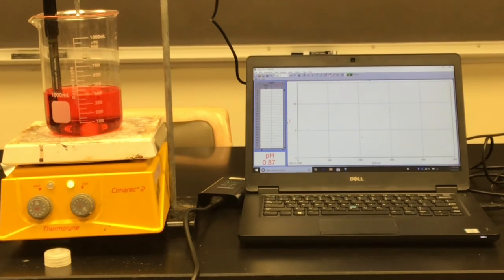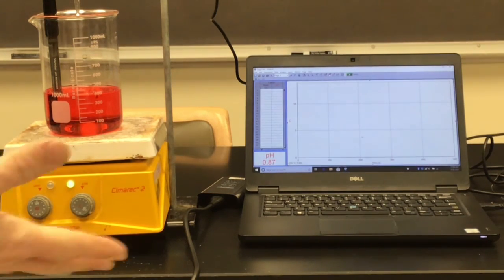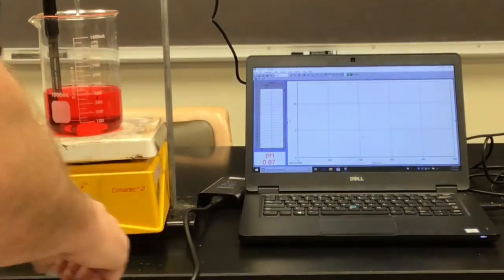Please note that the computer is going to be a little behind the color because of the time it takes to collect the data and so forth. So the computer is going to be a smidge behind what we see there. But most people predict that we're going to get a nice even trend of a straight line and a nice progression from red to orange to yellow to green to blue to indigo to violet. So let's go ahead and see what we can see here.